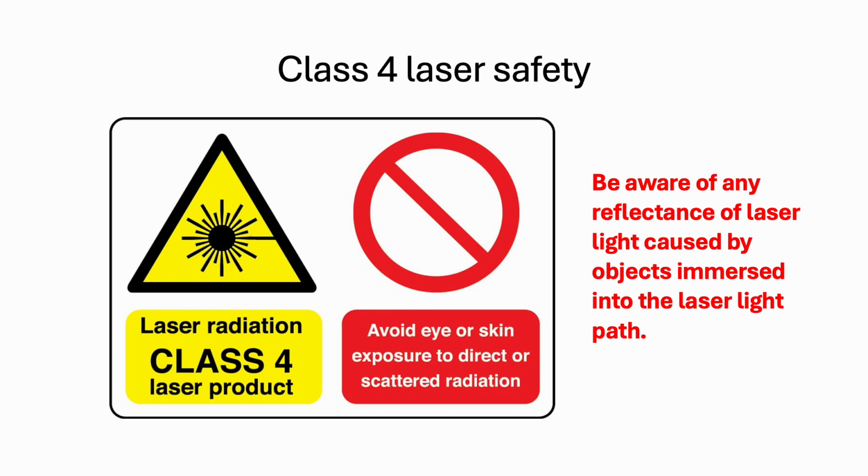Hazardous, visible, or invisible radiation from two-photon lasers can cause permanent damage to the retina, skin burns, and fire. Always follow proper laser safety protocols for your equipment and situation. Be aware of any reflectance of laser light caused by objects immersed into the laser light path. Before you take any measurements, it is important to familiarize yourself with all laser safety rules and requirements to avoid eye and skin exposure to scattered or direct radiation.